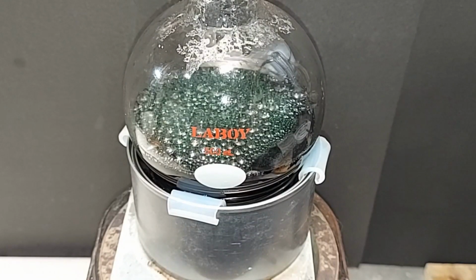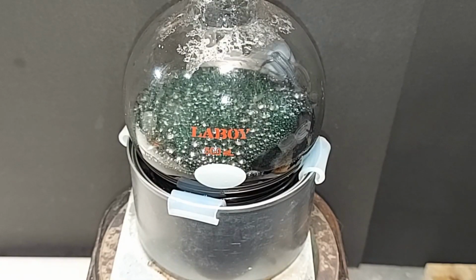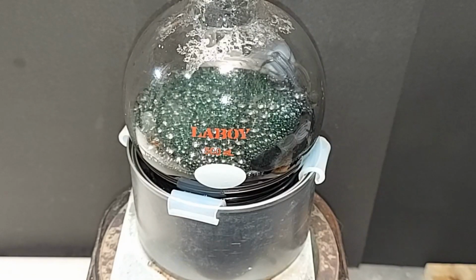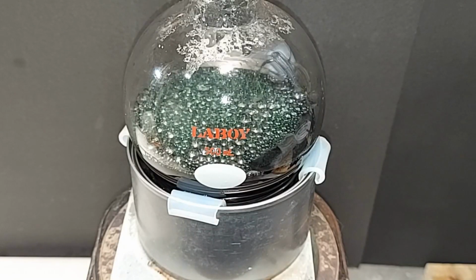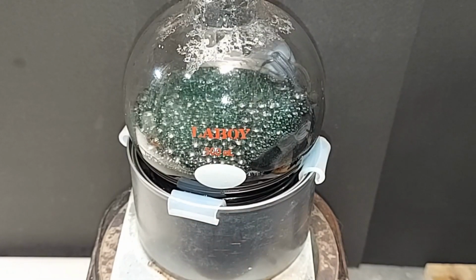What might look like boiling is not boiling. What's happening is the solution on the inside of the round bottom flask there is running down the walls, and when it hits the really warm, hot green stuff, it's just causing it to burst into some bubbles there. But it's definitely not boiling. It is time to shut this off, so I'm going to do that and collect our formaldehyde.